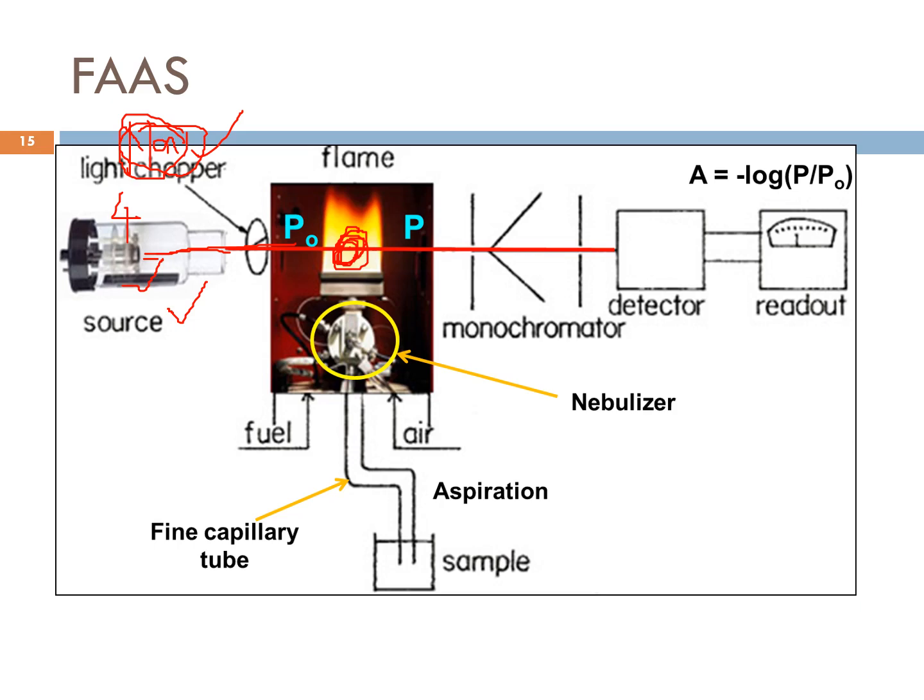Then it will absorb here, as we learned earlier, it absorbs radiation. Then what is transmitted, the part not absorbed, is P. It will go through the monochromator. The monochromator again filters the wavelength that we want, then it is detected here and displayed on the readout. So to get the absorbance, it is negative log P over P0.